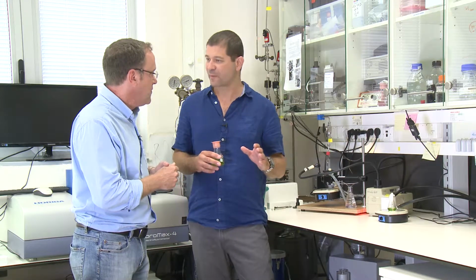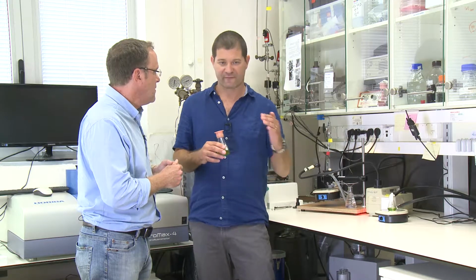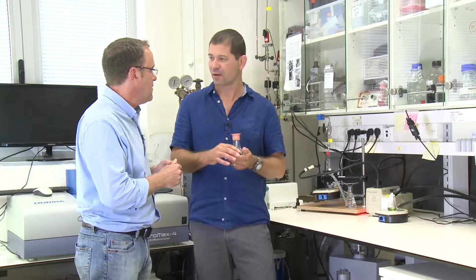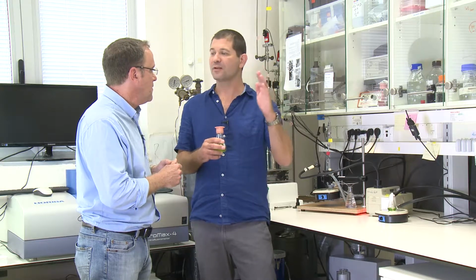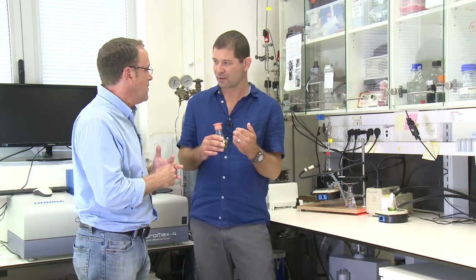So we designed two experiments that we are going to see today. In the first experiment, we will see how light intensity affects the yield of oxygen production. In the second one, we will use a chemical that specifically blocks photosystem 2, and we will see what it does to the photosynthetic electron current. And all of that is only by monitoring the oxygen production.